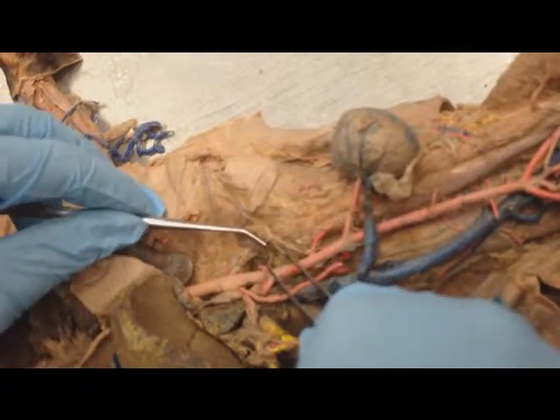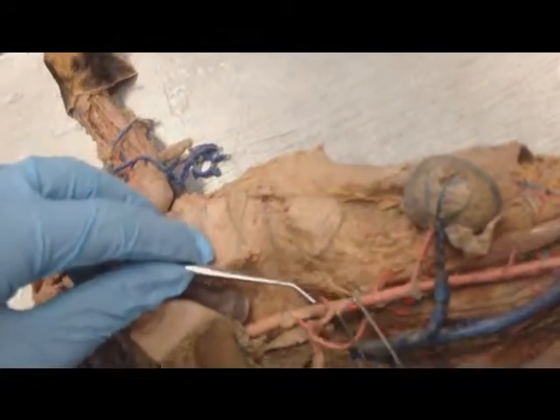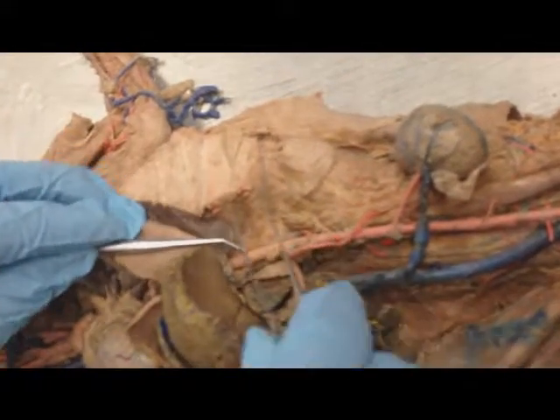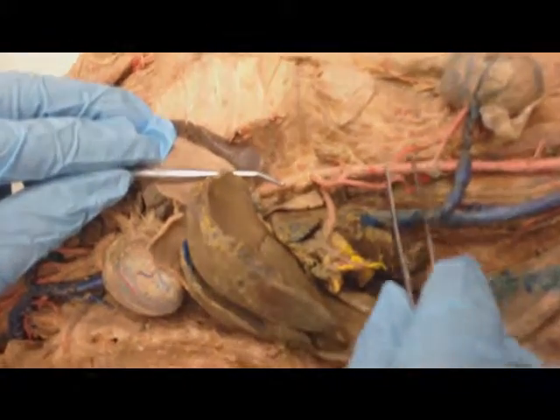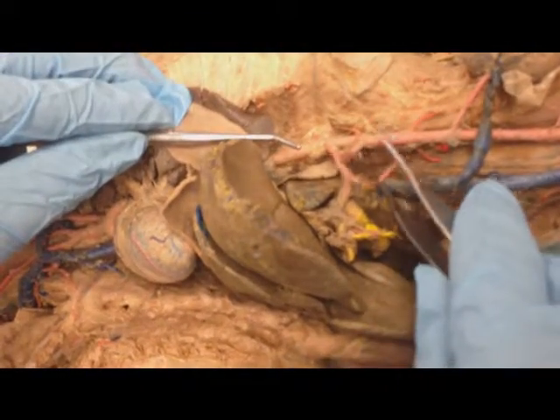All right. I would probably say in this cat, this is the superior mesenteric. Often you'll find the superior mesenteric up here though, but it's usually not a tiny branch like these. It's a bigger branch like this.